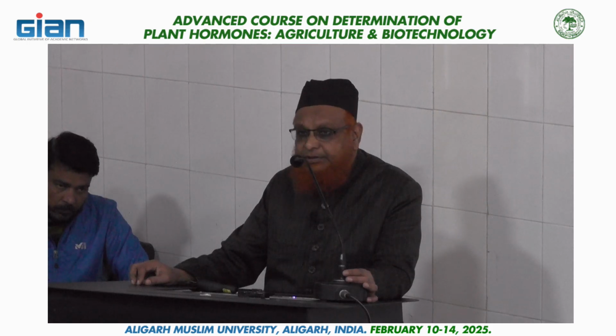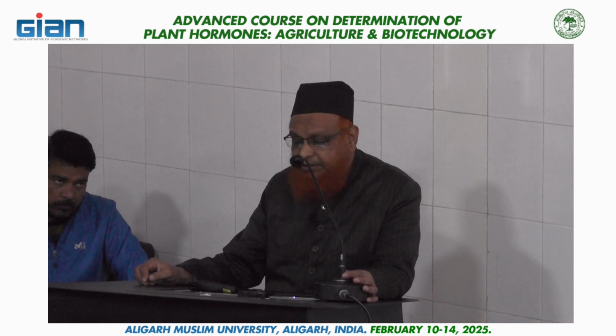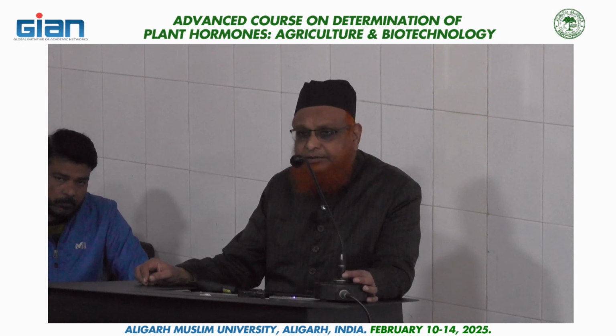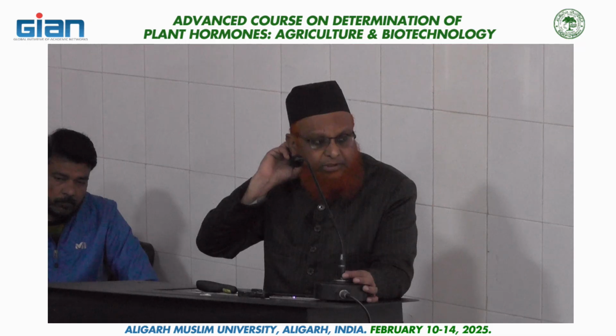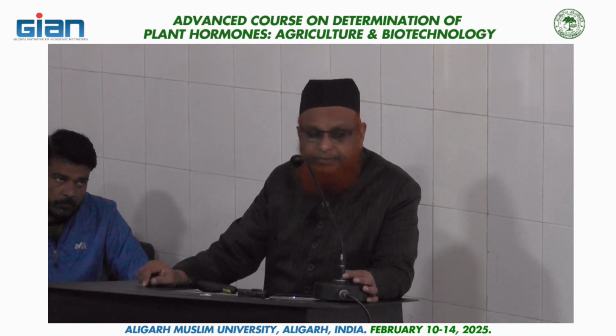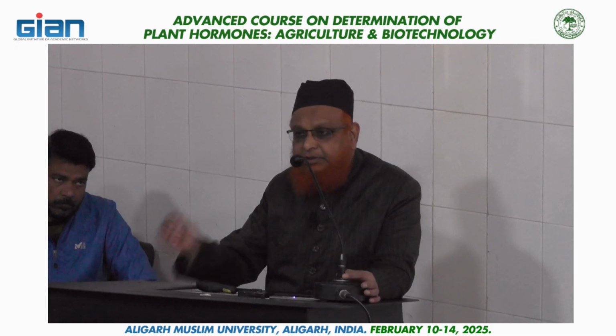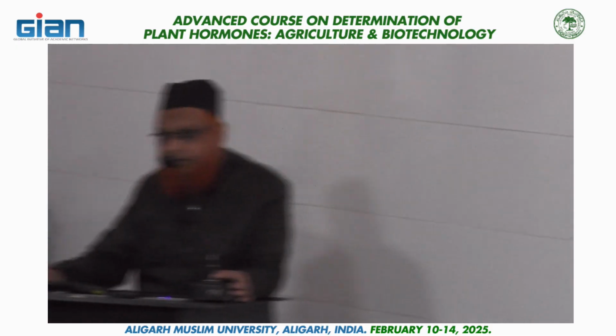First I purchased a suction pump from the USA. That was not very expensive. Then I purchased a hot plate from Mumbai, and the rest of the setup was prepared over here. Unfortunately, the suction pump I purchased from the USA was defective and not working, so I purchased a new suction pump today. And instead of a hot plate, today I am using an induction plate or induction cooker.